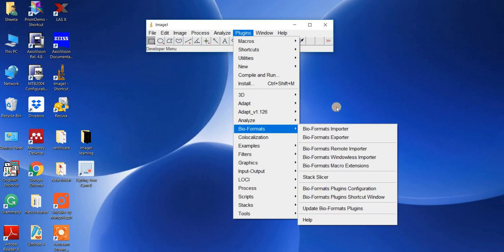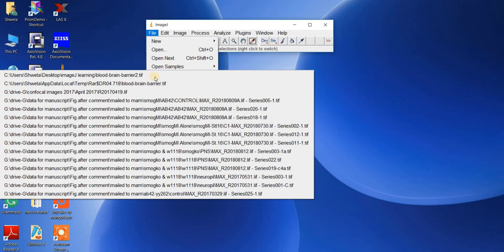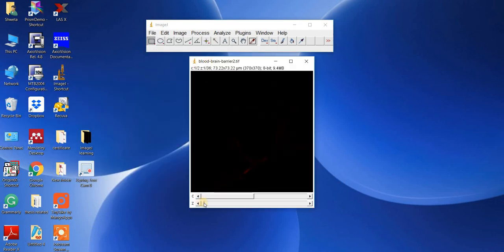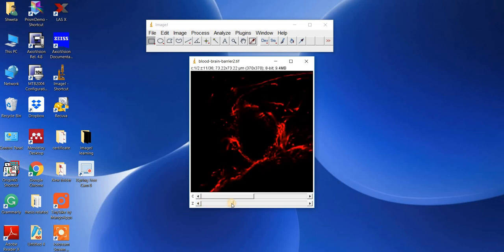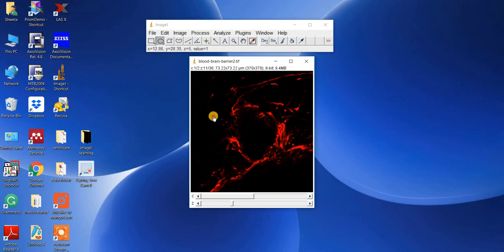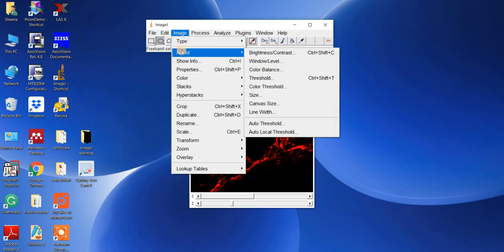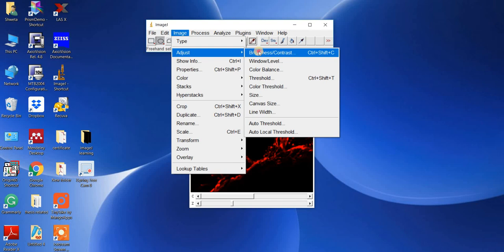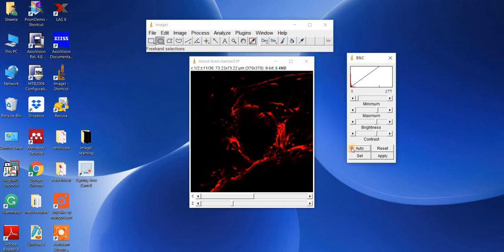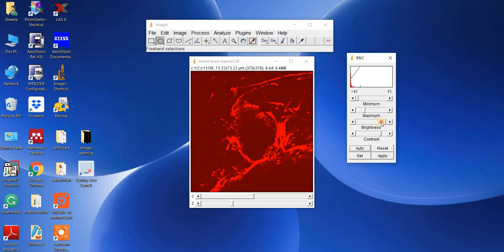I'll explain with one example. Let's open a confocal image. This is one confocal image. This is a marker — an analytic tool by which you can measure any particles available in your confocal images. For example, there's a small particle-like structure here that you can outline and measure. If you want to adjust brightness and contrast, go to Image, then Adjust, then Brightness and Contrast. You can click Auto or manually increase brightness and contrast.